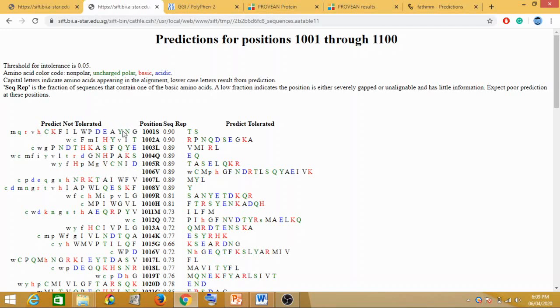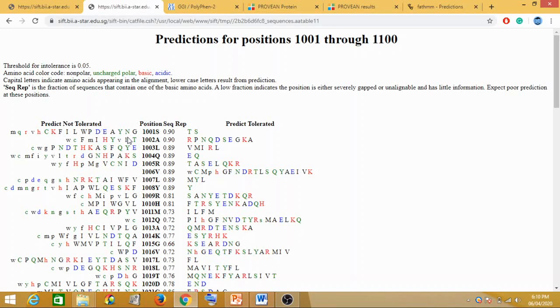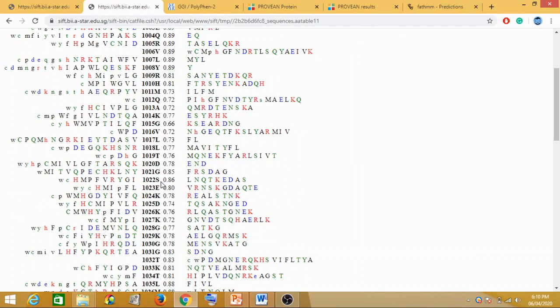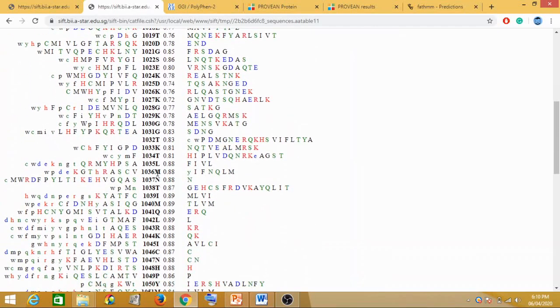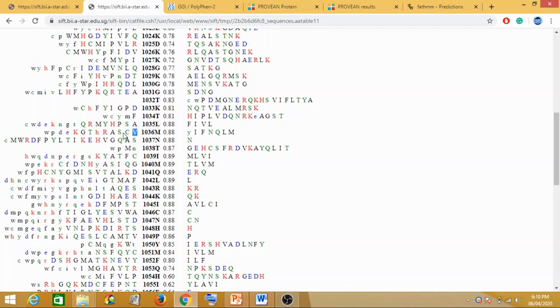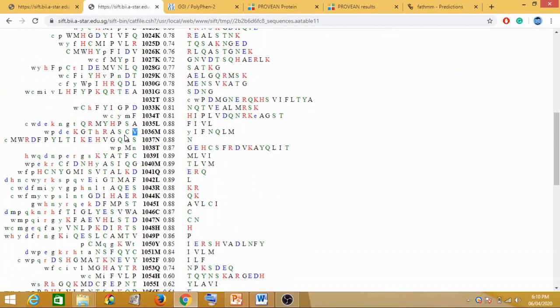For example, we had predicted our methionine which is getting converted into valine. Will it be not tolerated or tolerated? We have to check whether at 1036 position, if our valine lies in the predicted not tolerated section, the mutation is deleterious. But if our valine lies in the tolerated position, it's not deleterious. At the 1036 position, that's your methionine. Can you see the valine? It's just here, so it lies in the left-hand side, which is predict not tolerated.